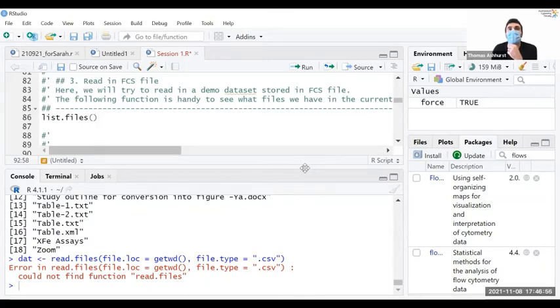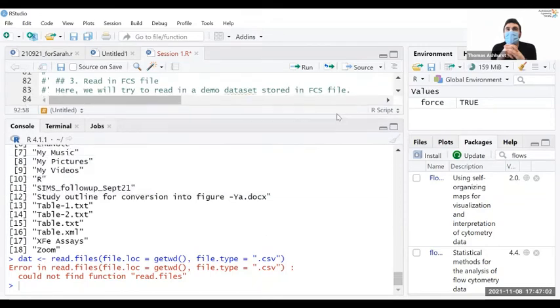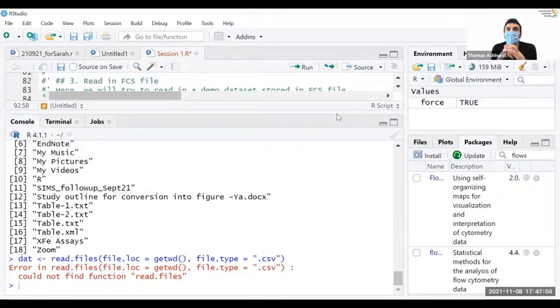What you should try running is... is this on the VRD or is this your own computer? This is your own computer. Sorry, actually, is this on the VRD or is this on your own computer? On my own computer. Yeah.